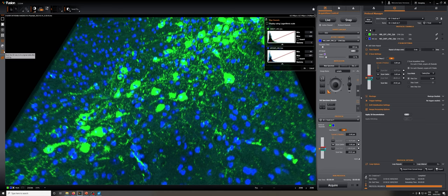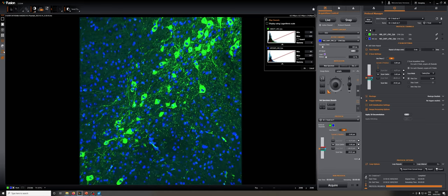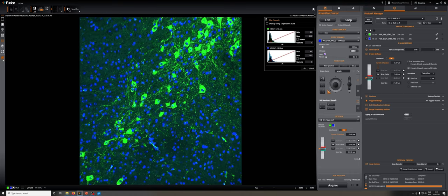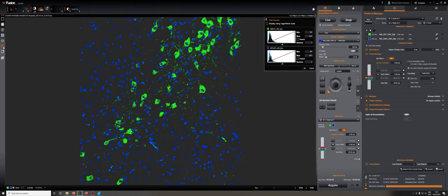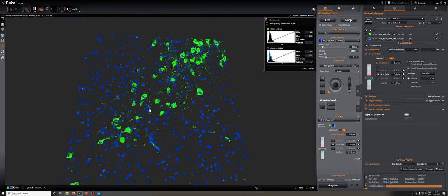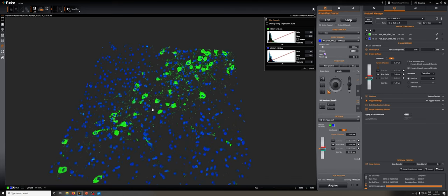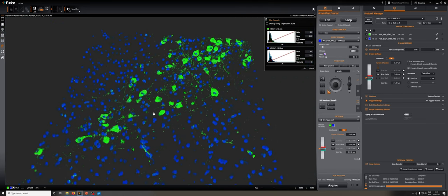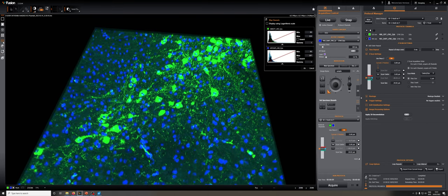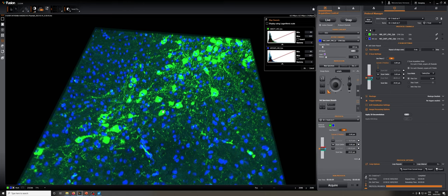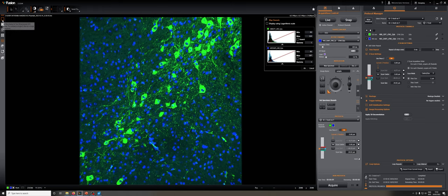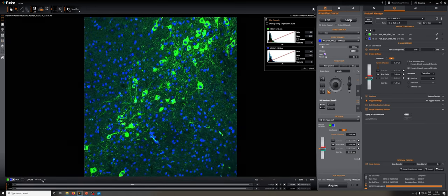This allows us to reset the 3D view to its original state. This, if it's engaged and there's montaging, shows things in the montage even if they haven't been stitched. I'm going to turn that off. This final view is a sort of blend 3D view, which can sometimes be more informative than this, which is a maximum intensity projection three-dimensional mode. You can reset the 3D by clicking here, or you can just go back to 2D, either single slices with this one or a maximum projection with this.